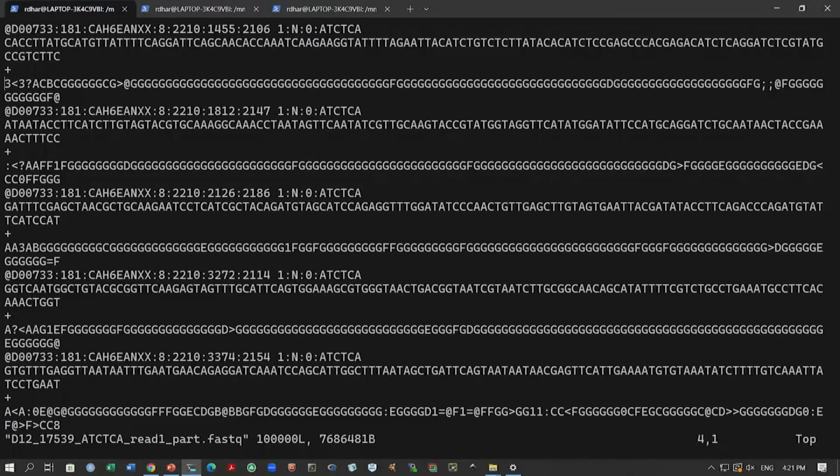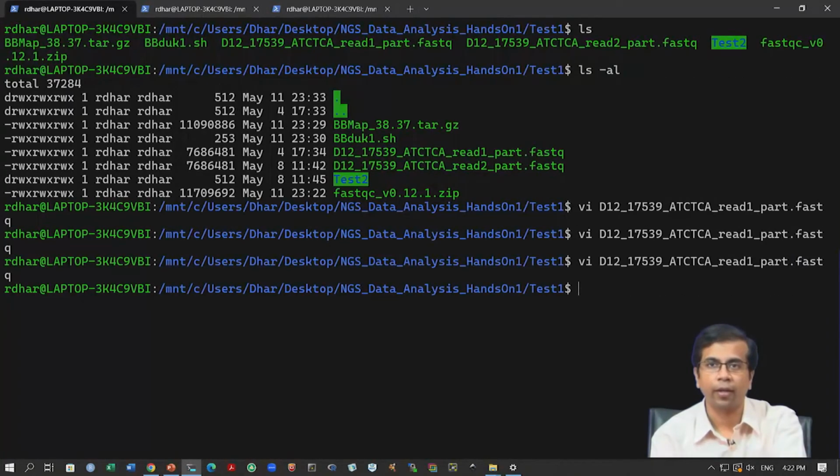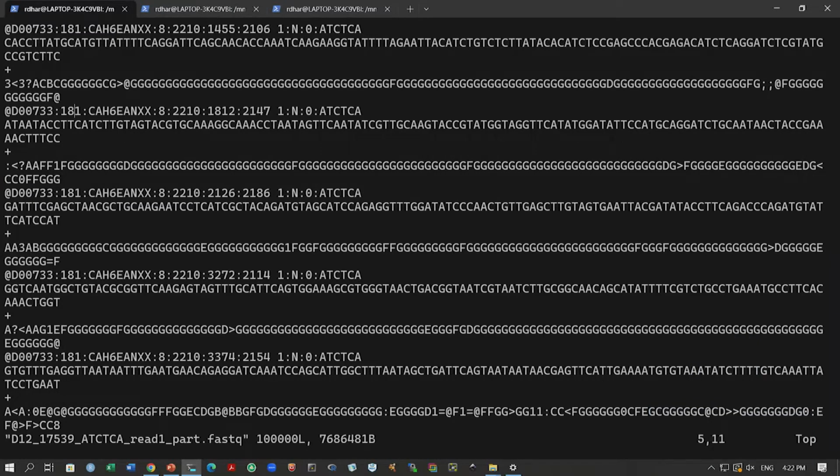Okay. Now, if you are writing anything and you do not want to save it, let us say we insert something by mistake, but we do not want to press U so many times, we just want to exit without saving the changes we have made in this file. How do you do that? We say :q and then an exclamation mark. The exclamation mark means quit without saving. Whatever I have written was by mistake, so we just want to quit without saving it. Okay. So, we can go back and you will see the changes are gone; whatever I had written earlier is gone.